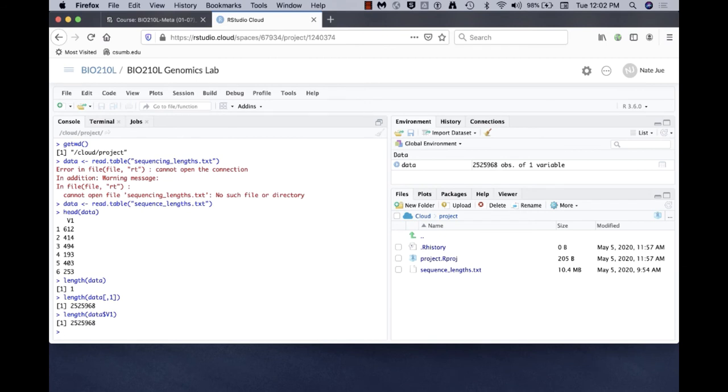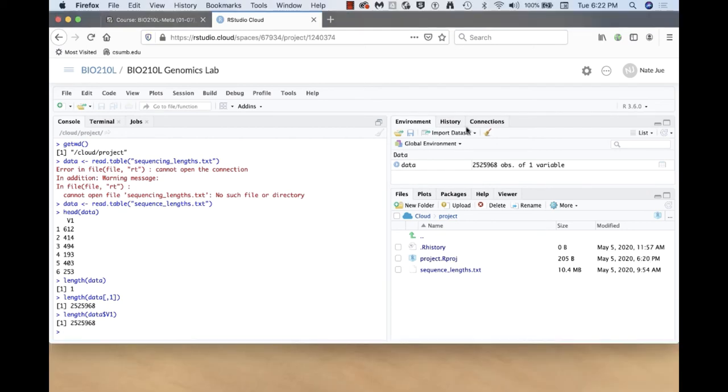So now I know how many sequences are in my sequencing run, and I can start to think about other ways that I can summarize this experiment so I can understand it. I can compare it to other sequencing experiments. Other people can look at my sequencing experiments and learn something from it. This is an important part of communication in sciences, using data and quantitative information to communicate information and interpretation about results. So what else can we calculate here?